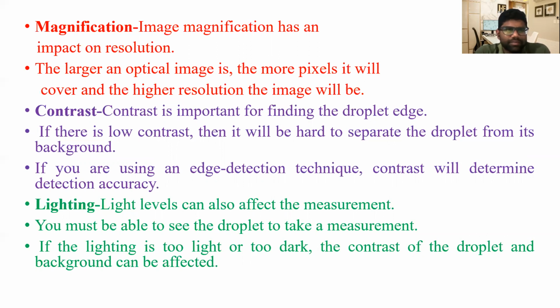Now, if there is low contrast, it will be hard to separate the droplet from its background, so the background and the droplet will overlap. And if you are using an edge detection technique, contrast will determine the detection accuracy.